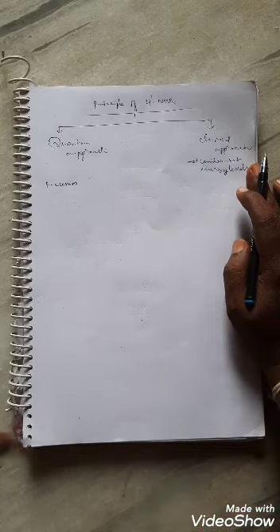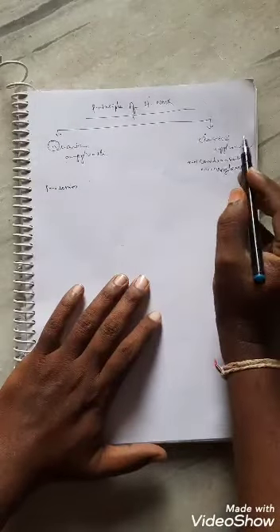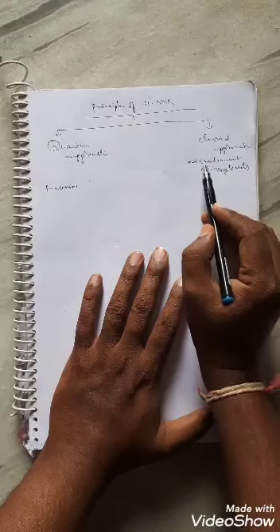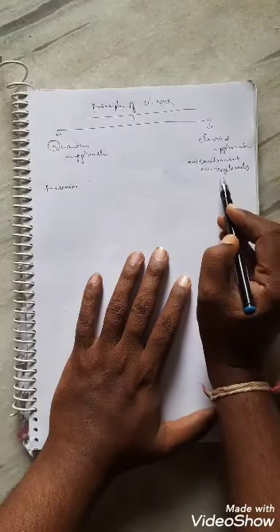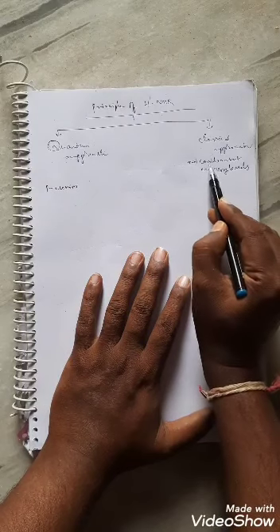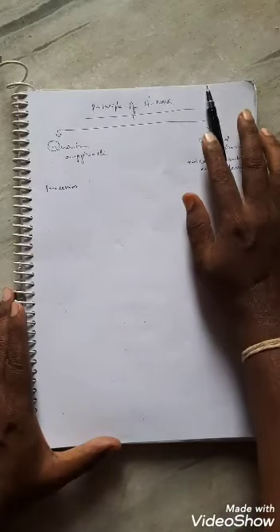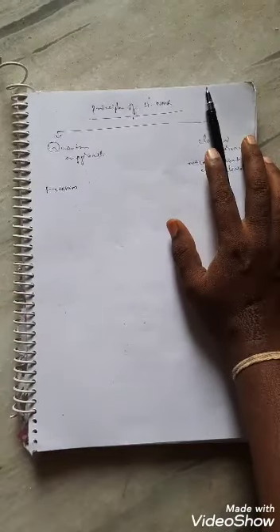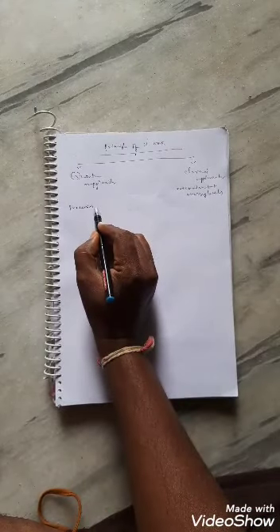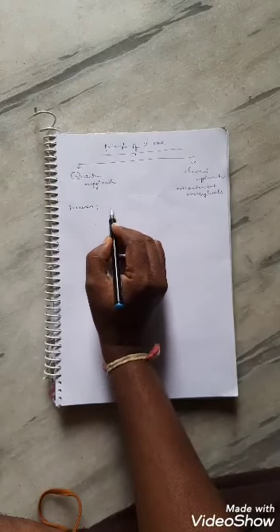And here, the classical approach or Newtonian approach. So this classical approach does not bother about the energy levels. In the classical approach, the nuclear magnet undergoes precession.